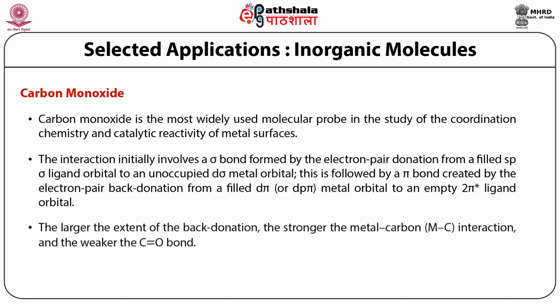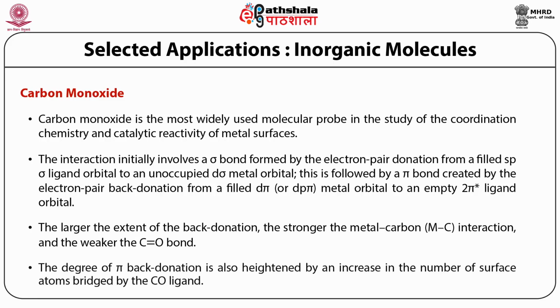The larger the extent of the back donation, the stronger the metal-carbon interaction and the weaker the CO bond. The degree of pi back donation is also heightened by the increase in the number of surface atoms bridged by the CO ligand.